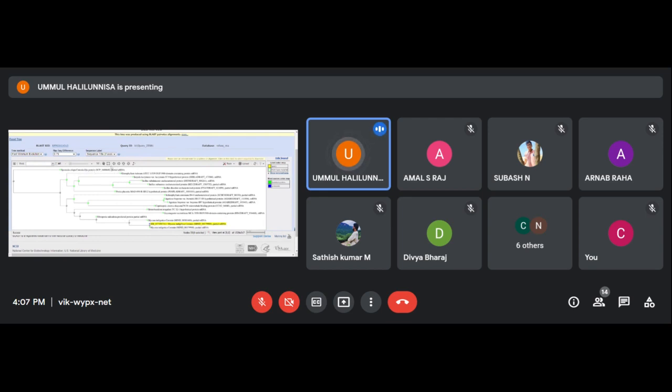Now can you see the distance between these two? Very closely related to this one is the same species, partial mRNA from Mycena, and the other is Mycena indigotica with a different ID. So this is how we see the homologous difference between those sequences. Are you guys able to understand why we are doing this BLAST? Is it clear, Arnab? Yes, ma'am. Got it, ma'am.